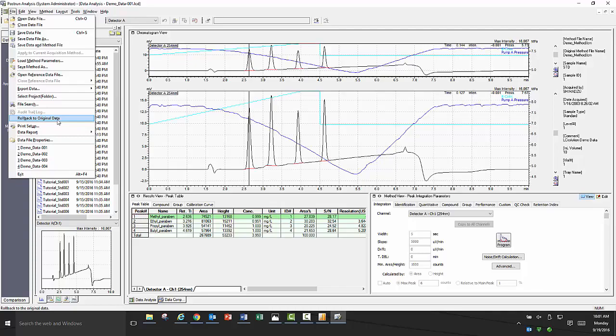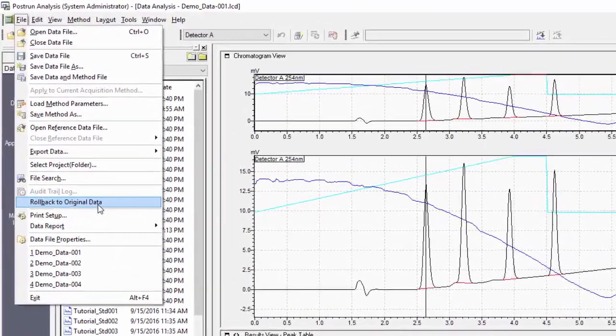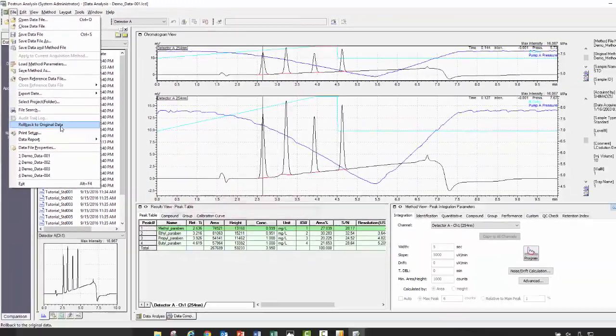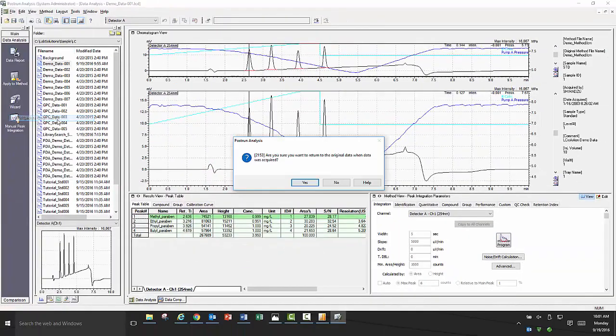With the data file open, go to file, select roll back to original data. It will prompt you to see if you are sure, then click ok.